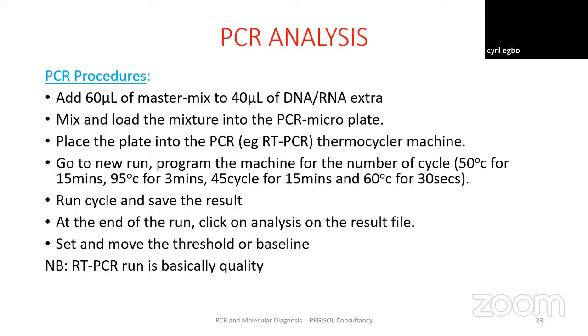But when you are doing this PCR amplification, this step, this bullet that I said you go to run, like in the practical session, you will just see go to run, but you will not see this programming.